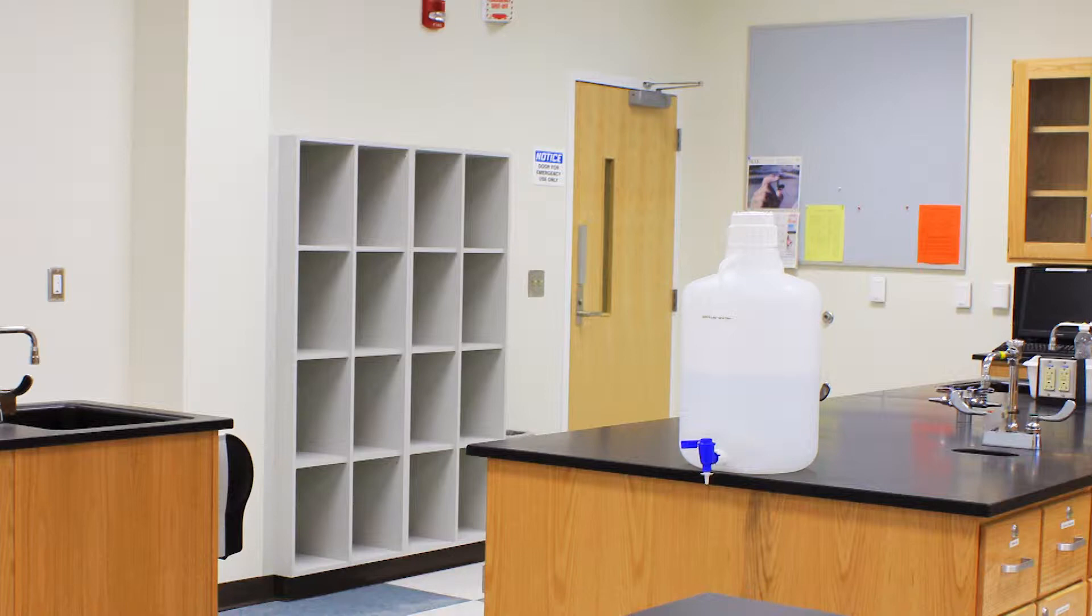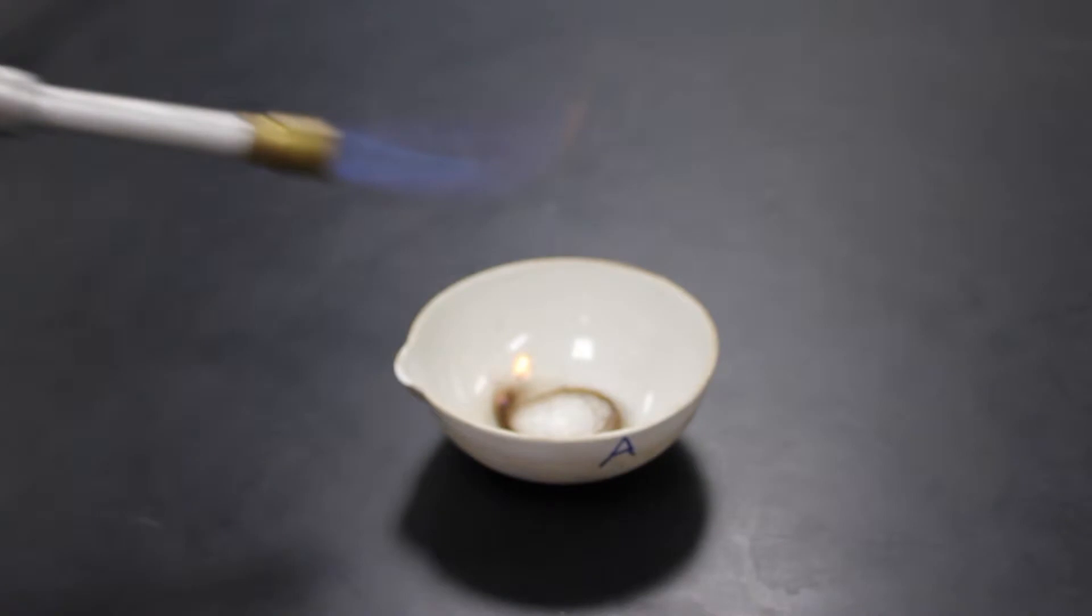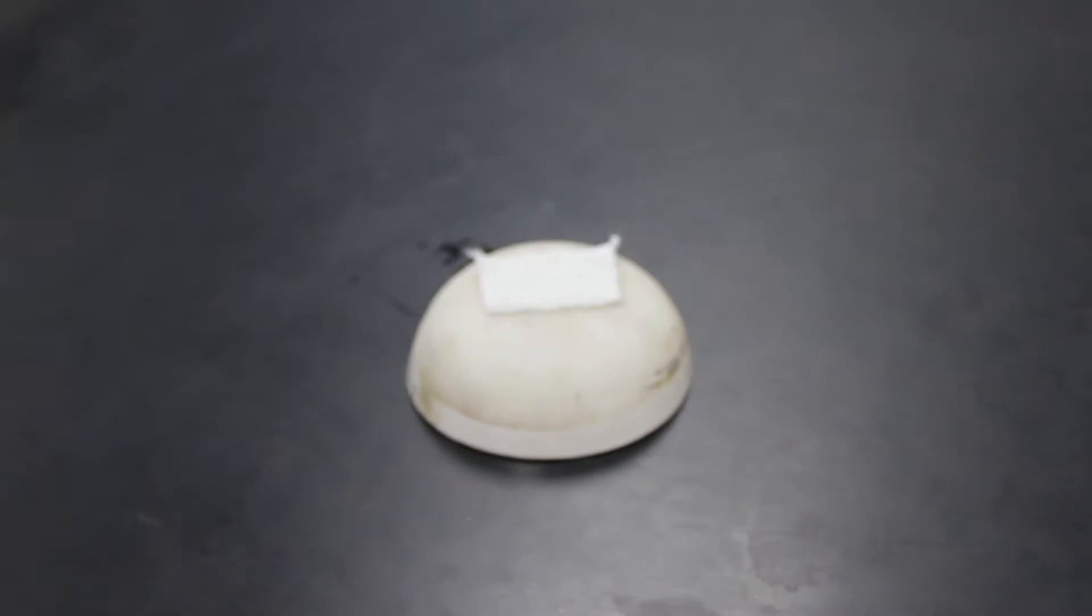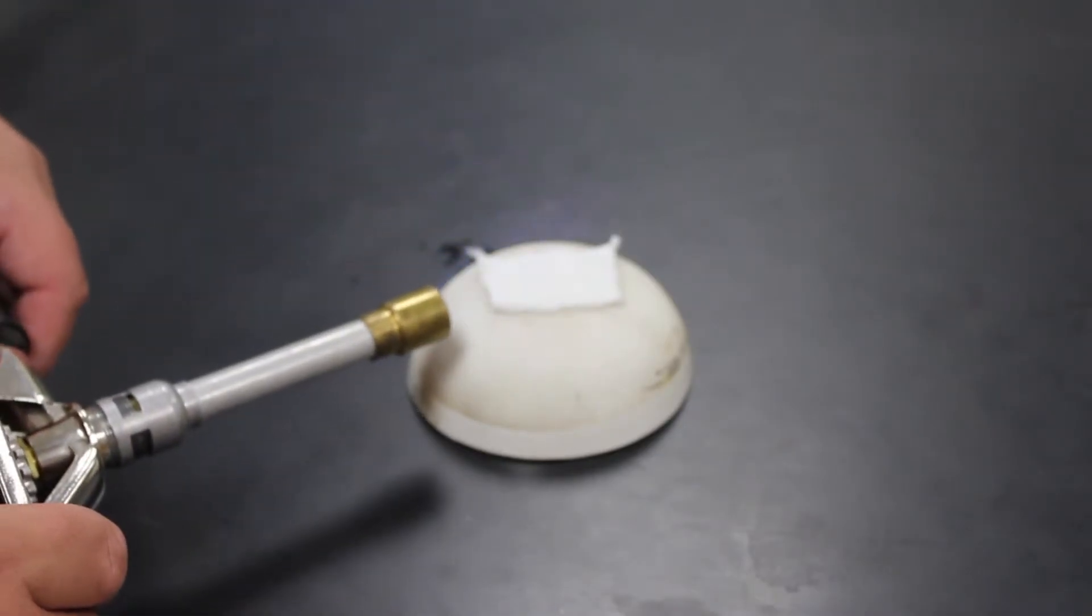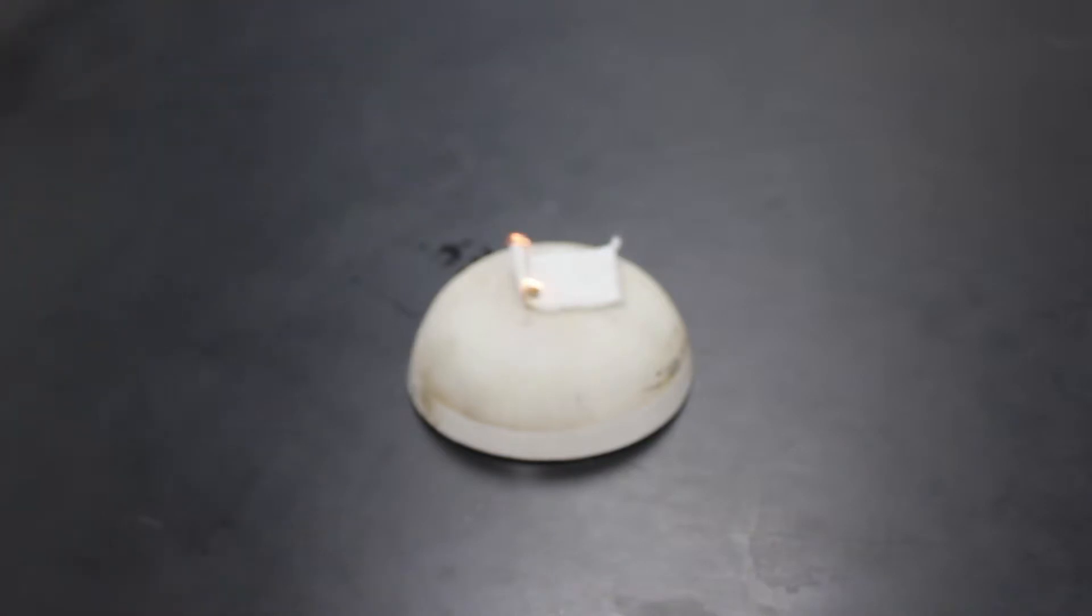Hair must be tied back during lab if you are using a Bunsen burner. Hair can easily catch on fire without you knowing. If your hair is long enough, it can get contaminated with chemicals that you are using. Also, the material you are wearing may elevate your risk of catching fire. As you see in the demonstration, synthetic fabric is much more susceptible to catching fire than cotton. If it does catch on fire, it may melt to your skin.